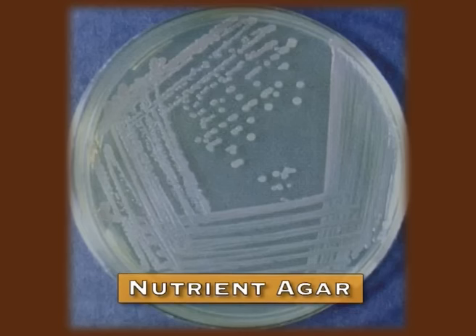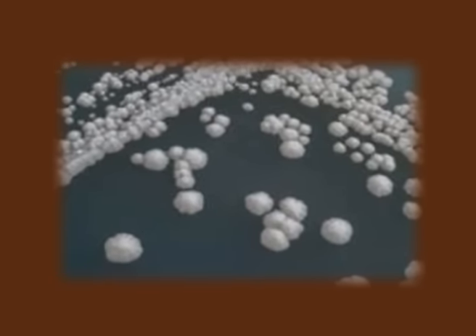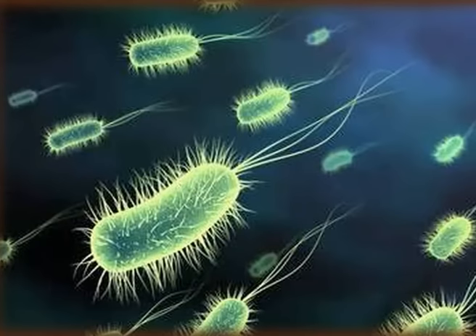Nutrient broth or agar contains ingredients like peptone, beef extract and NaCl, and can be used for the growth of non-fastidious organisms. Since they contain ingredients which are non-specific in nature, they are mainly used to grow a wide variety of bacteria in the lab.